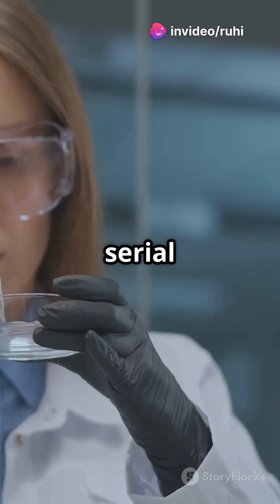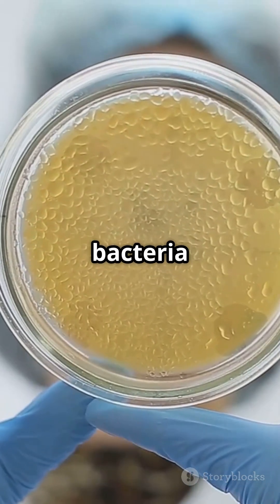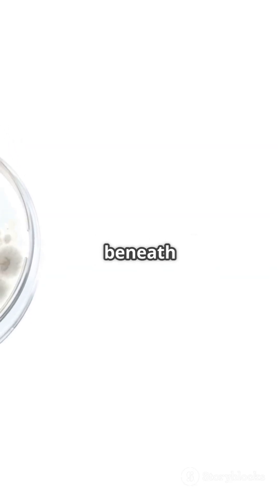So there you have it — serial dilution, spread plating, and streaking. Three simple steps to isolate bacteria from soil. Give it a try and uncover the hidden microbial world beneath your feet.